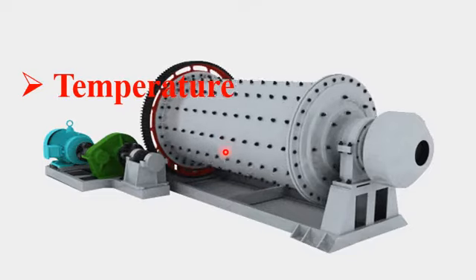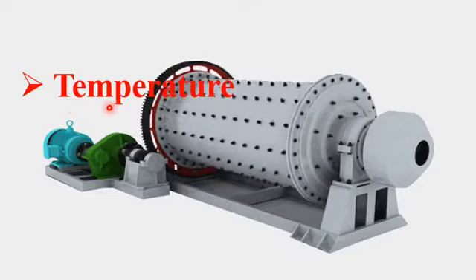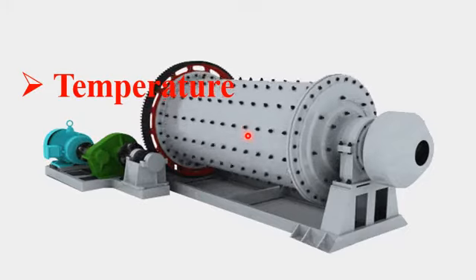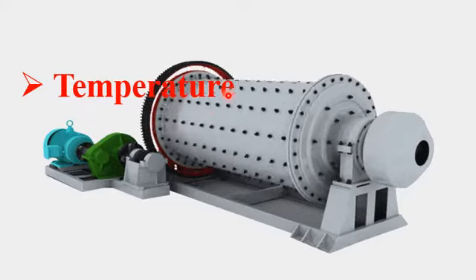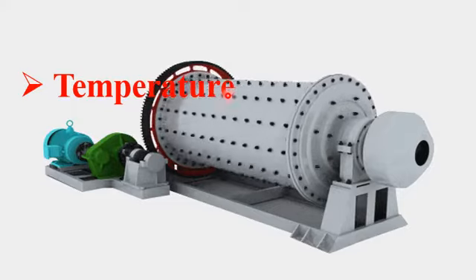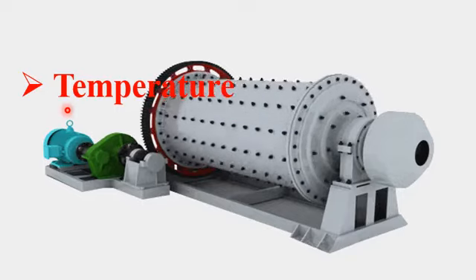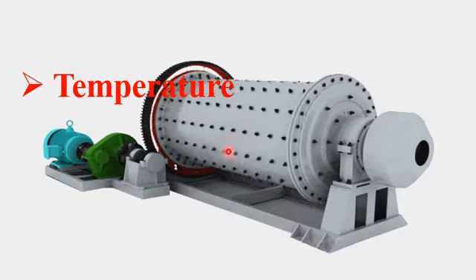So in conclusion, the milling temperature or the temperature inside the ball mill drum is very important in getting a final fine nanoparticle. The end product or the nanostructure which we obtain after milling the bulk material, its structure, will depend on the temperature inside the ball milling chamber.